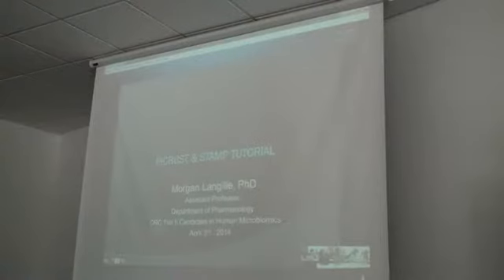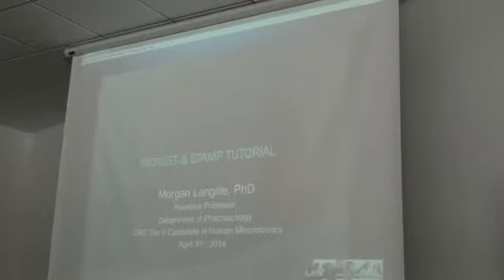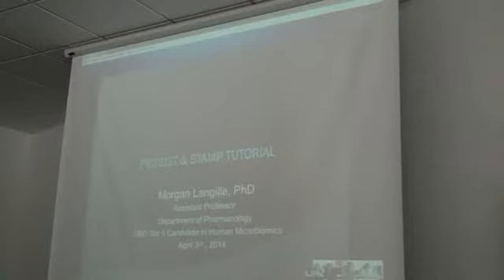So what I'm going to present here is PICRUSt, and also how PICRUSt feeds into a tool that's been published for a little while called STAMP. The idea by also showing STAMP is that it actually shows you what the data looks like and allows you to do some visualization. So for people that don't know me, I'm Morgan Langille.